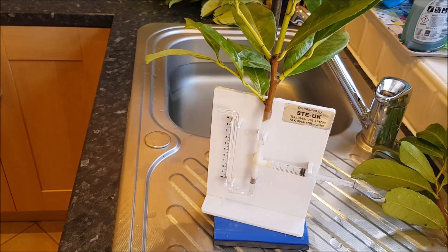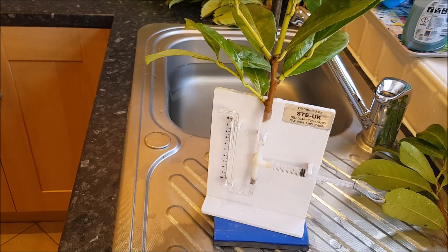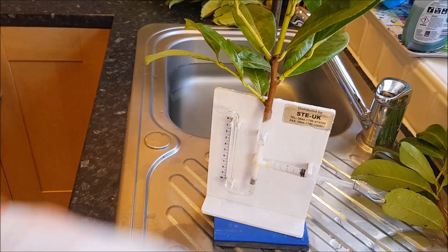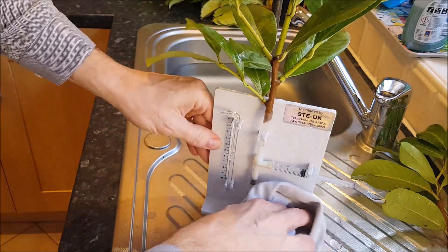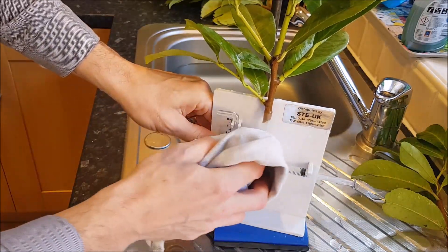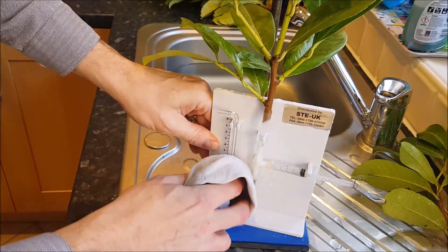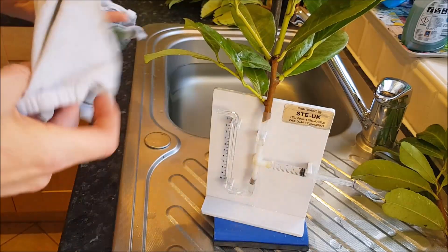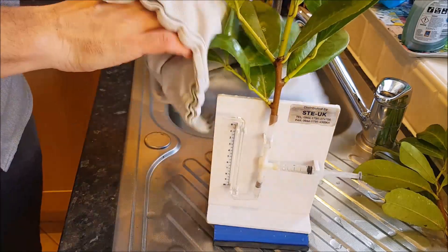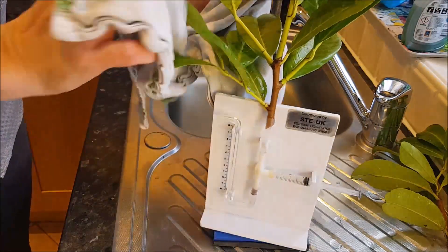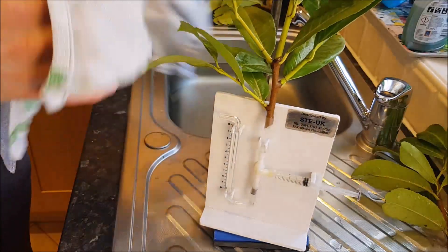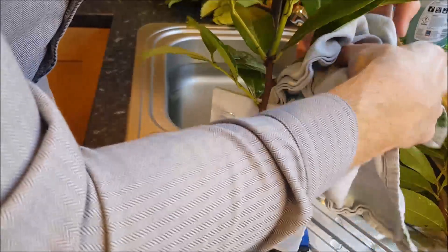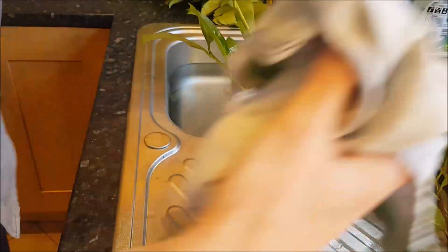So I've taken the plant and the potometer out of the sink now. What I'm going to do is dry everything down with a tea towel. I'm going to check there's no leaks because remember we mustn't let any air get in and also we want to be able to see the water uptake. I'm also going to dry off the leaves just so that transpiration won't take place. If the leaves are wet then obviously less transpiration is going to be able to occur if the stomata are wet and all that kind of stuff.